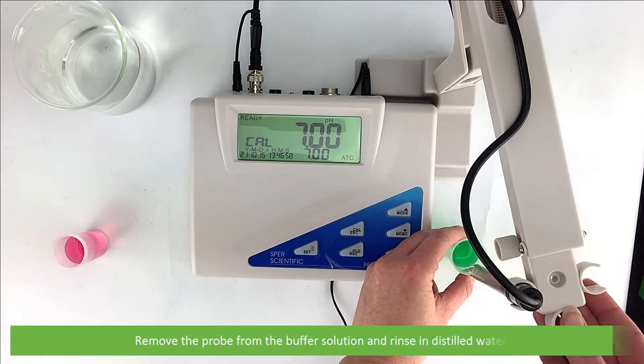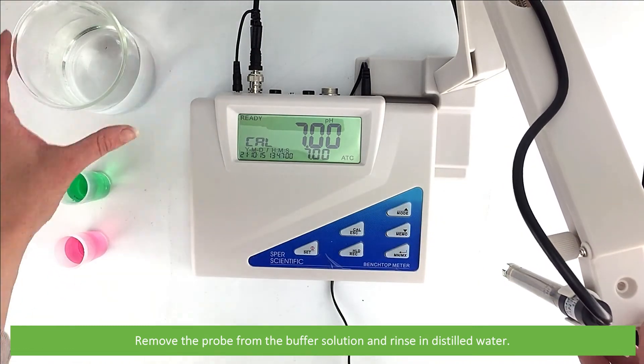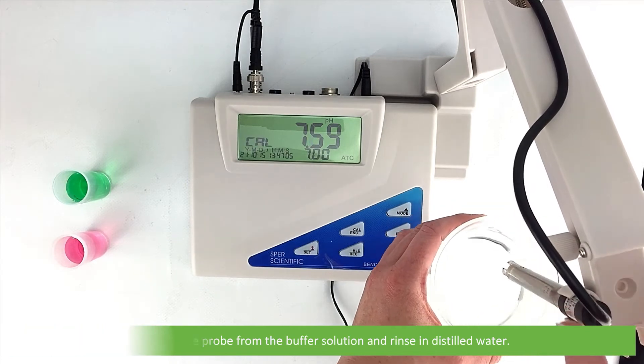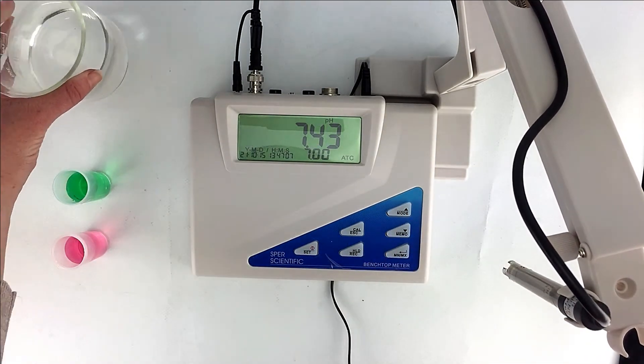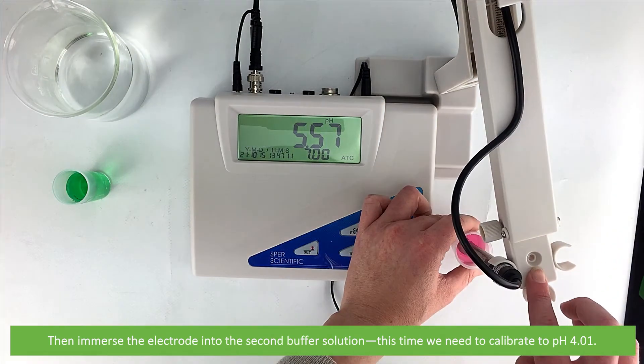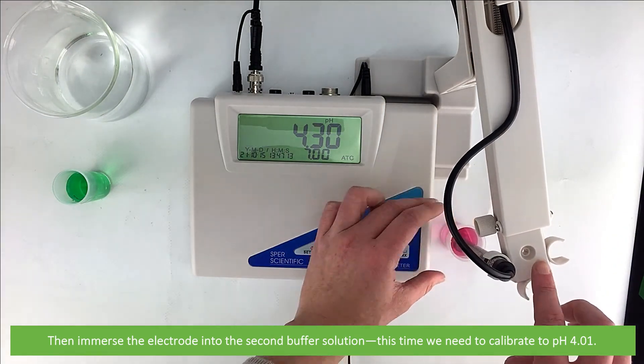Remove the probe from the buffer solution and rinse in distilled water. Then, immerse the electrode into the second buffer solution. This time, we will need to calibrate to pH 4.01.